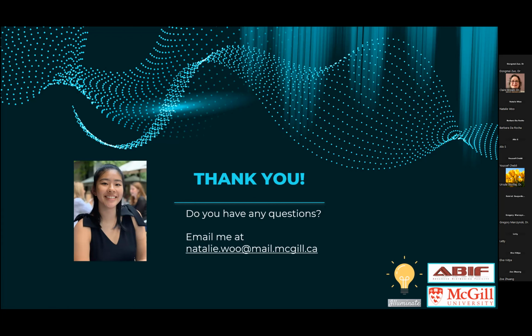Yep. Thank you. No worries. Based on what you said, are there examples of live cell work? Yeah, so one of the downsides is you can't use live cells because you have to fix your tissue cultures or fix your tissues. It would be very difficult. I think maybe you can try developing a protocol if you're interested, but I don't think it's possible to do live cell. Not that I know of, maybe somebody in the audience can say something. Okay, yeah, that makes sense.